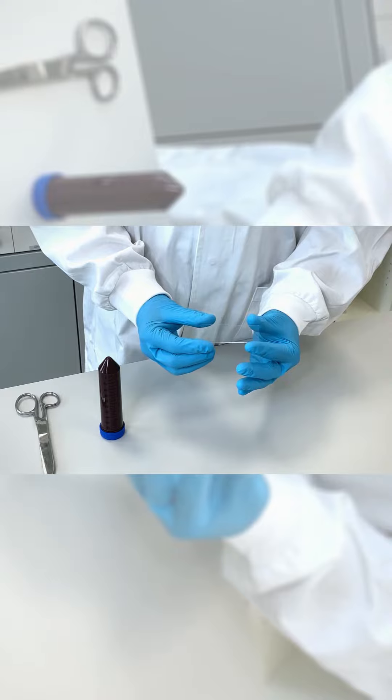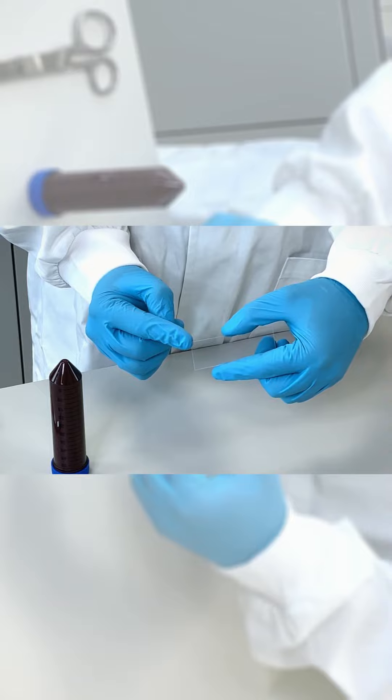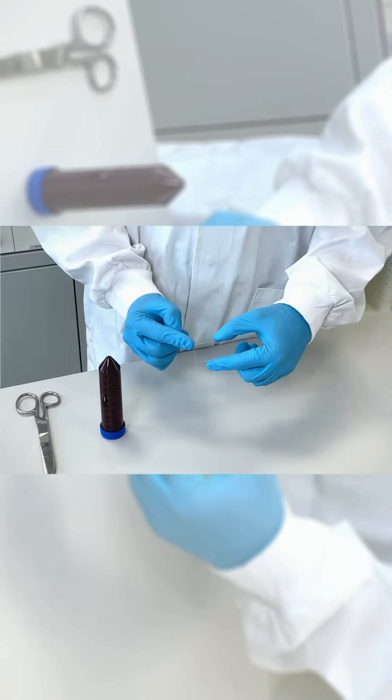To distinguish which side of the DMA is the functional side we marked the right upper corner. It is very important not to touch the surface. This might affect the coating.